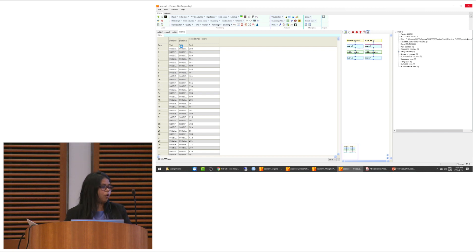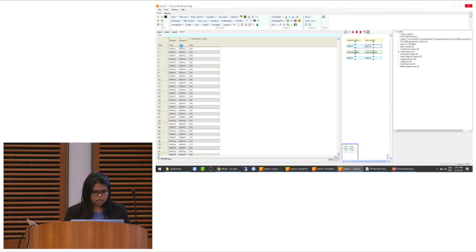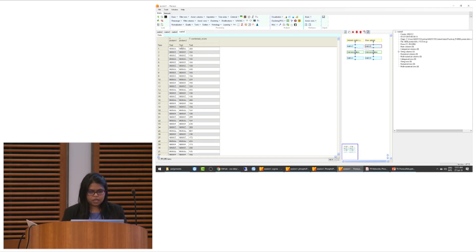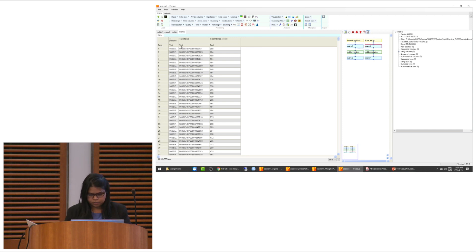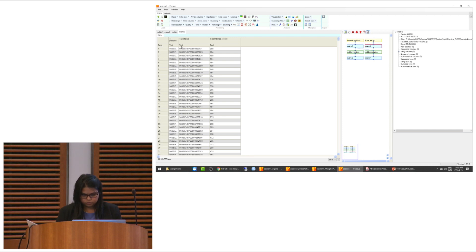For loading the STRING database, we have to go to Raw Upload, not Matrix Upload. Go to Raw Upload, select, and then select the STRING database file. This file is not tab-separated but space-separated, so split the columns by space and then click OK. It will take some time because it's a huge database containing all protein IDs.